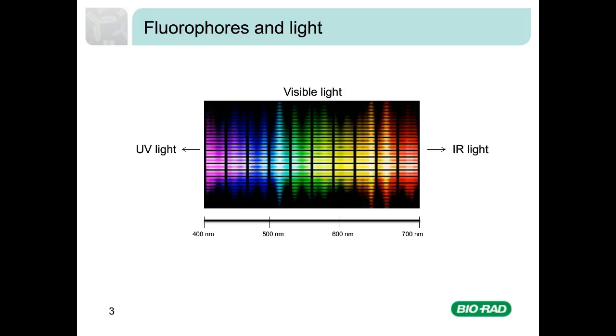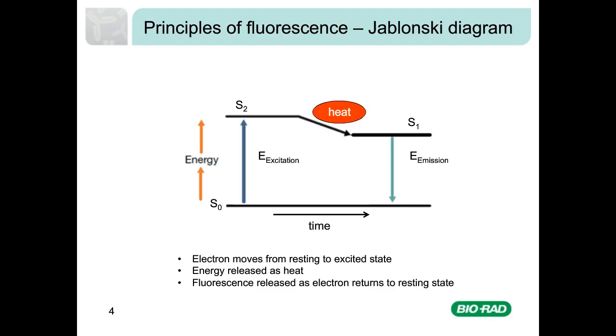When a fluorophore, such as fluorescein, which was the first fluorophore to be commonly used in immunofluorescence, absorbs light, its electrons become excited and move from a resting state, shown as S0 in this simple Jablonski diagram, to a maximal energy level called the electronic singlet state, shown as S2 in this diagram. The amount of energy required for this transition and the length of time spent in this state will differ for each fluorophore. The fluorophore undergoes a conformational change.